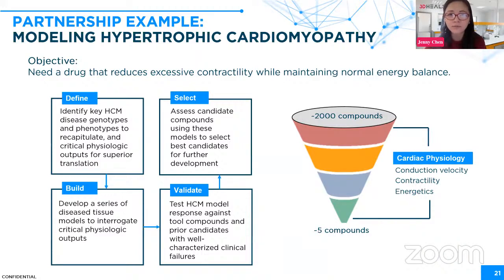with your current models? Yeah, so not yet comparison to animal models, but 100% something that we will be doing. It is on our roadmap to do, right? That comparison will be critical to validating our technology. The comparisons against organoids, today we compare against 2D monolayers because that's typically what is used to screen different aspects of cardiomyocyte response. And typically, it's very apparent that three-dimensional tissue is going to perform better than a 2D monolayer that doesn't consist of any structure.